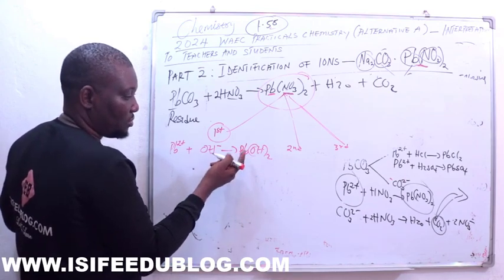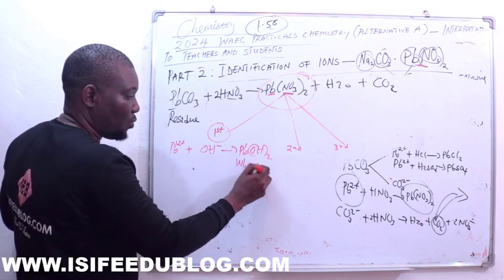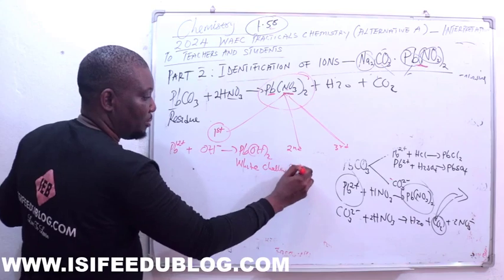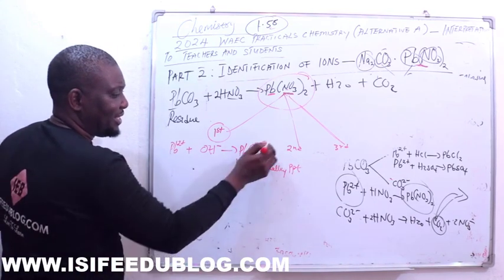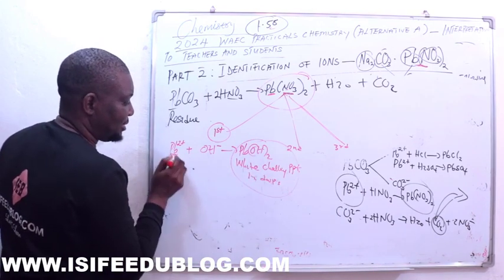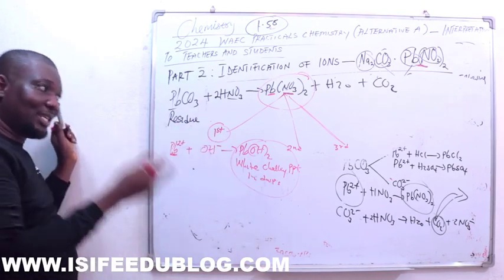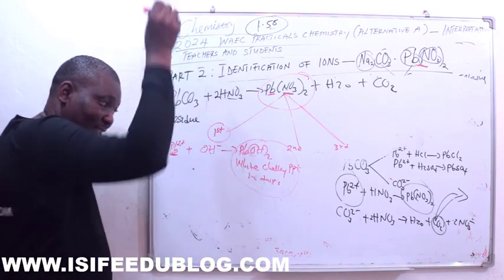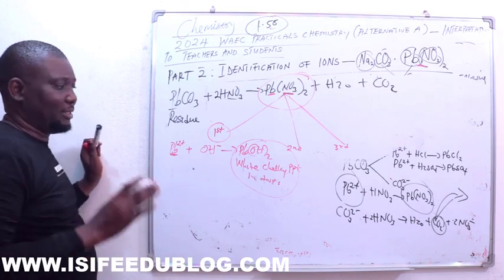What is the color? It's white, and chalky in nature. Chalky precipitates. This is what is found in drops. Given that lead is amphoteric, it will dissolve in excess alkali. So in excess, the precipitate dissolves. The precipitate will disappear automatically.